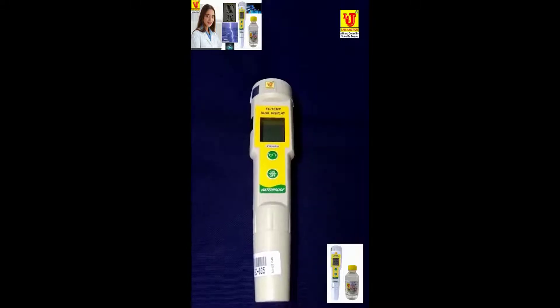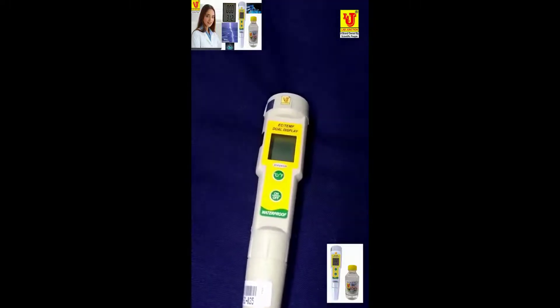You Lab junction. Waterproof. Easy. Electrical conductivity. Temperature. Dual display meter. Model LJ EC035 — this is our main meter.